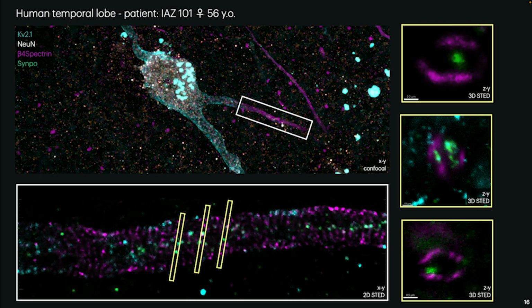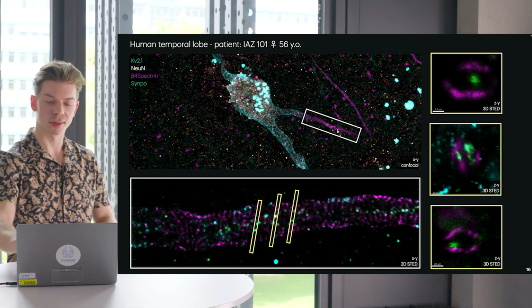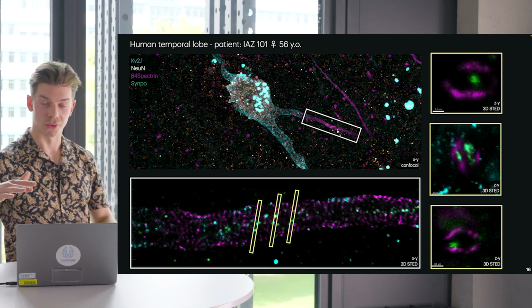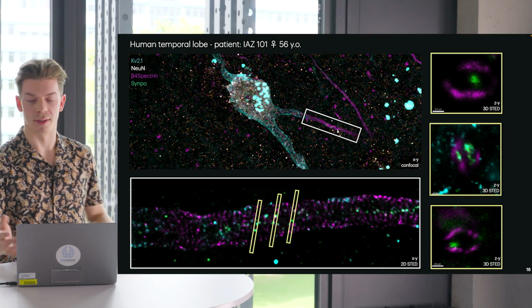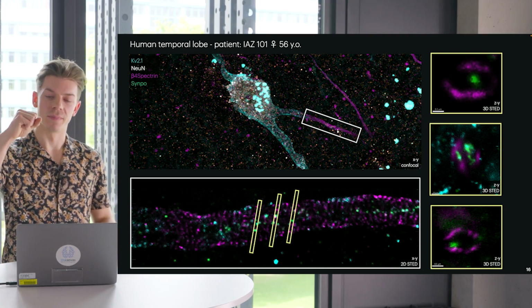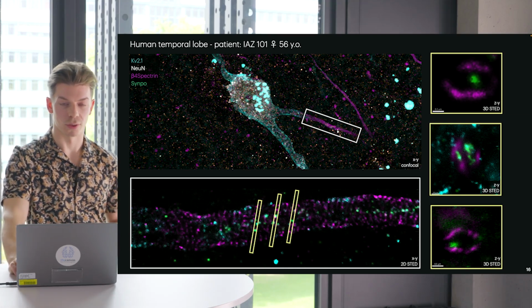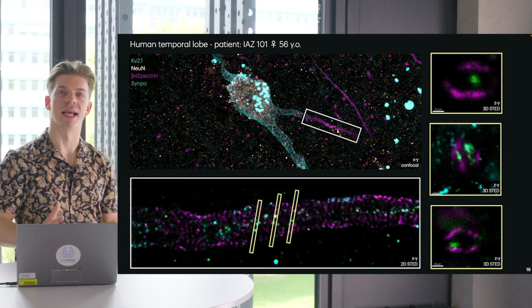That means instead of imaging whole 3D volumetric data, we take a 2D STED image of our neurons and of our AIS structures. And alongside these yellow marks you can see in the lower picture, we are now able to take an axial cut through our axon and show and prove whether certain structures like the Kv2.1 channels are actually clustering within the deficient gaps of the ankyrin G or beta-IV spectrin, or if they lay below or above, and how close they get to our cisternal organelles.